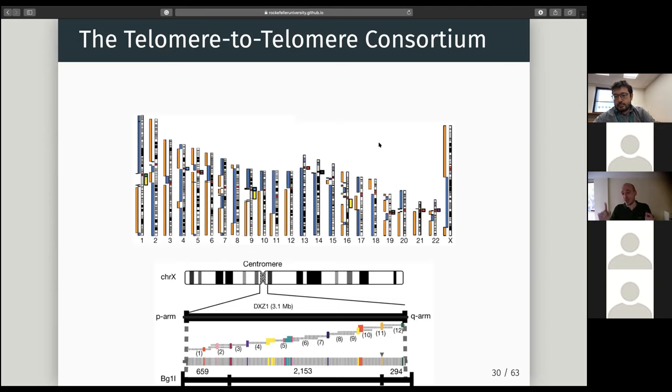What you may want to do here is to shorten the length of your reads so that you make many more passes and you can estimate the length of your repeat with much more accuracy. But I think two approaches, targeted genomics or transcriptomics, will work in this case. With the targeted genomics, there was no PCR. They use CRISPR. For IsoSeq, there will be PCR, yeah.